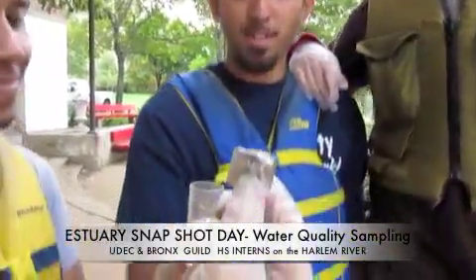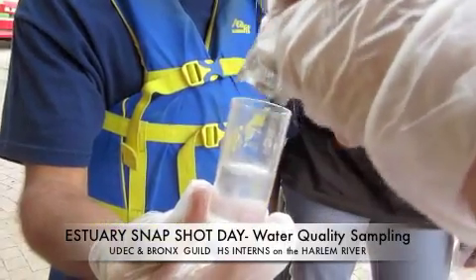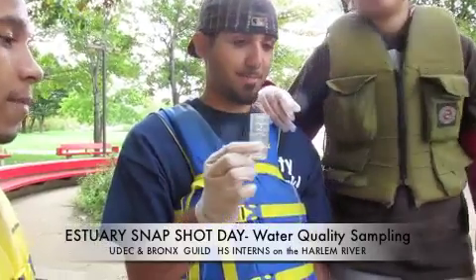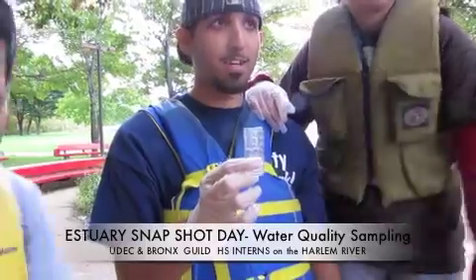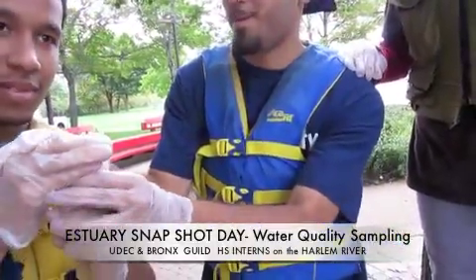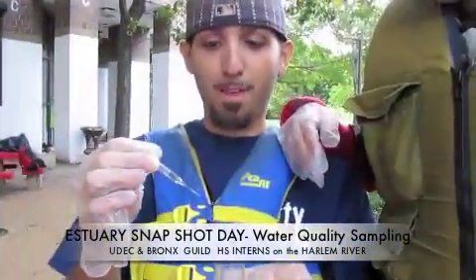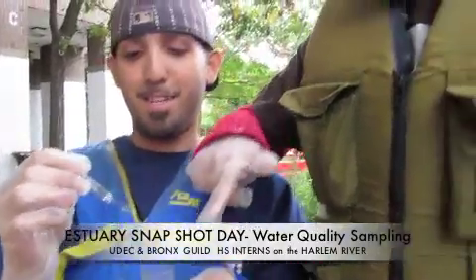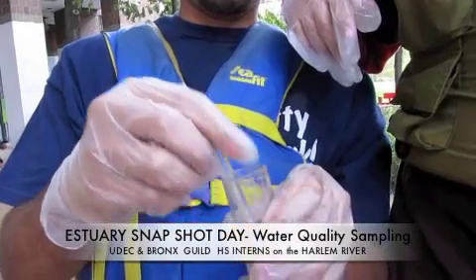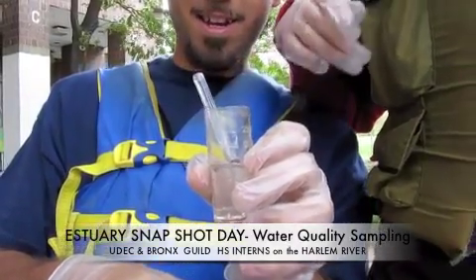Next, we'll be pouring a packet of nitrate into the water. Now we're going to let this sit for 3 minutes. You have to shake vigorously. Now we are going to break the ampule inside the water with the nitrate in it so that it can have a chemical reaction. We're just gonna let it sit for a few seconds.